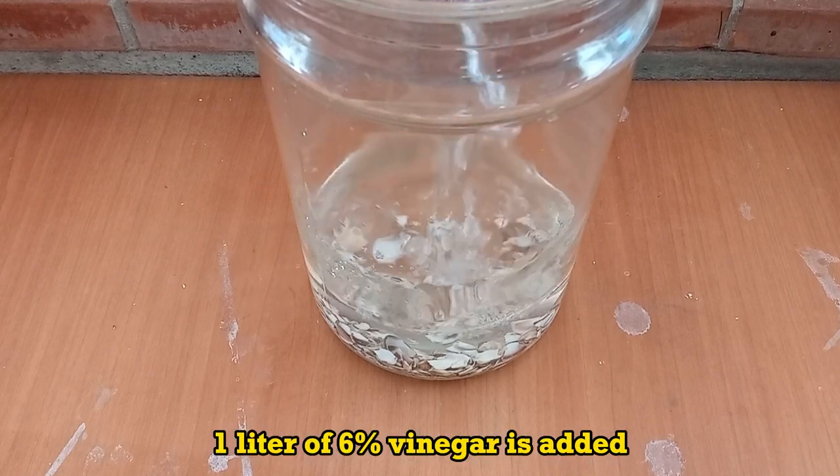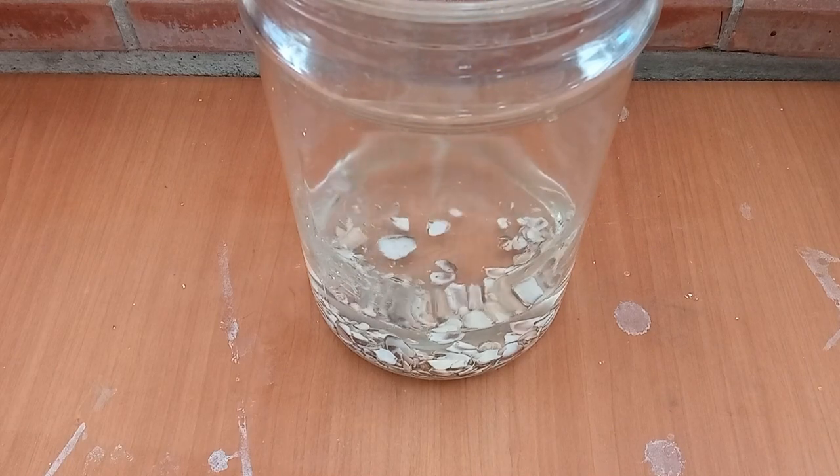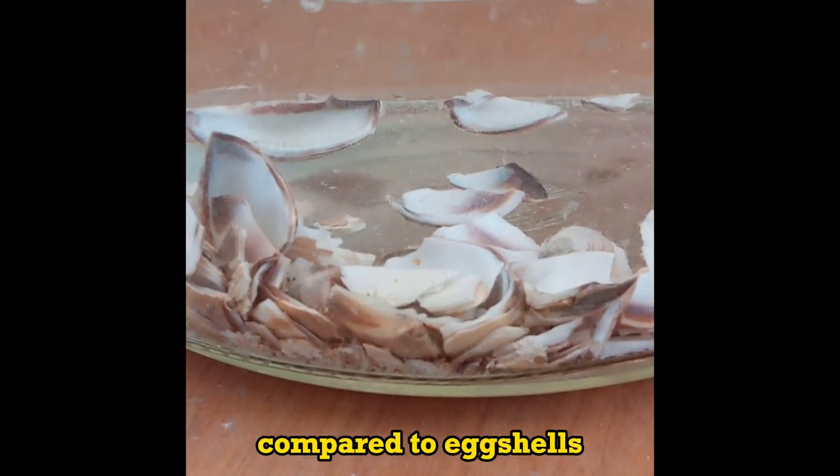One liter of 6% vinegar is added. Reaction starts quickly, but clamshells react much slower compared to eggshells.